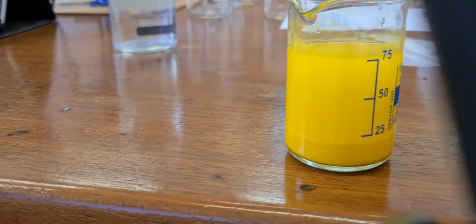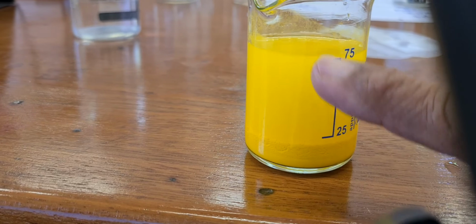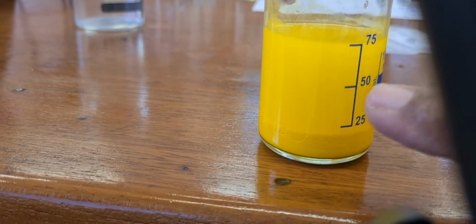So before I leave you, I just wanted to take you back to that beaker, where the precipitate, the yellow solid is there, and the top is clearing.